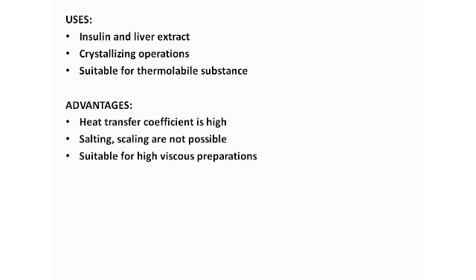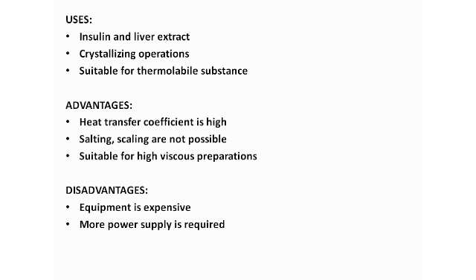It is suitable for highly viscous preparations. As for disadvantages, as the pump and other accessories are there, the construction is quite complicated. The equipment is quite expensive. More power supply is needed because we have an additional pump attached here. So this is all about the equipment used for evaporation.